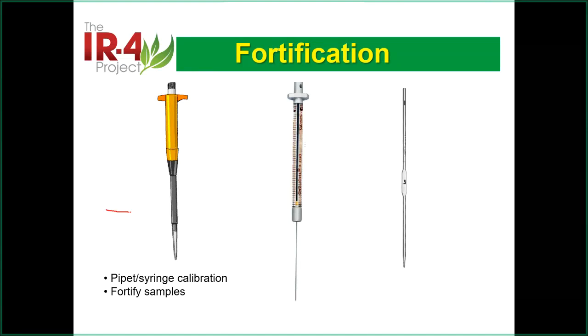Most labs use this kind of micropipette because it has a mechanical piston going inside. You will have to verify at least every day. So I do that every time before I use it. Okay. So sometimes some people may use this already.